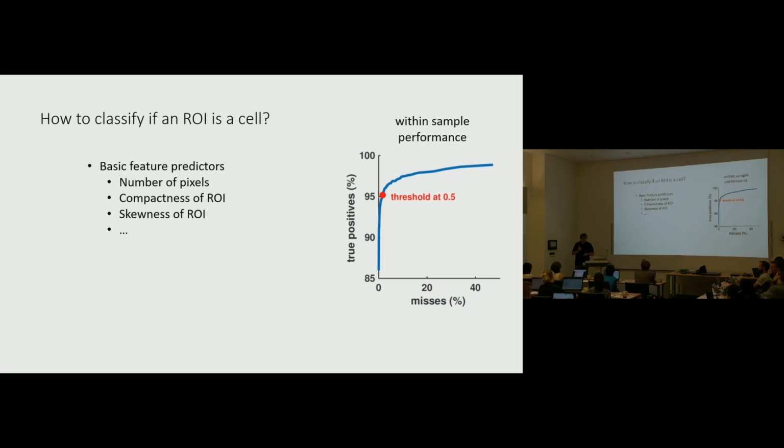There is one situation that is for more specialized discussions, like longitudinal recordings. You might have a cell that's not active on one day or one session and then becomes active later, and so you don't want to miss it on that first session, right? The first approach we're going to try with team longitudinal is just concatenating data sets and seeing how well that works, because that will get rid of the problem. If it's active on at least one of the sessions you concatenated, then you'll extract its fluorescence throughout. If that doesn't work, and it's early days from what we've tested, so we'll see how things go, then we'll probably have to do more work in a kind of post hoc step to deal with that.